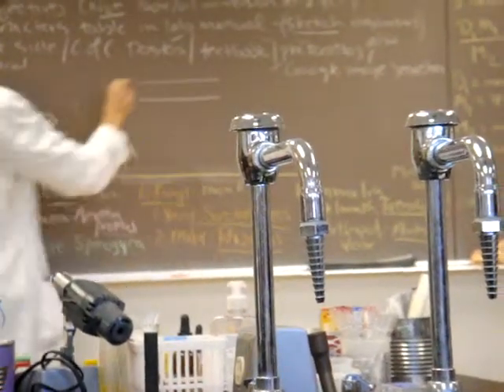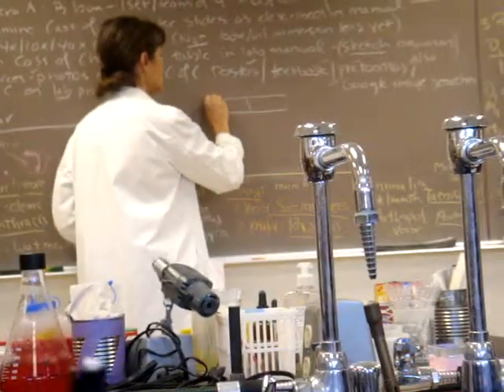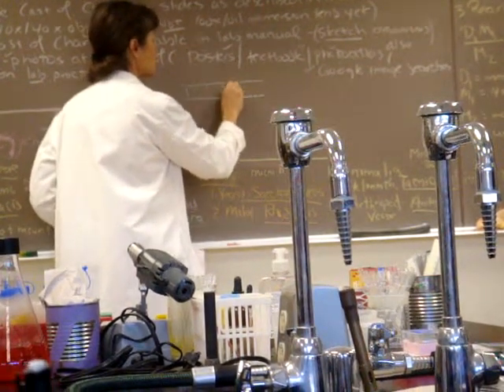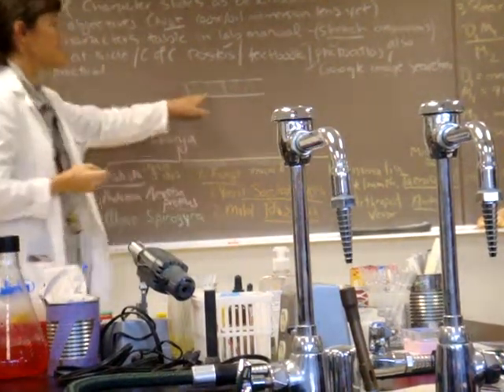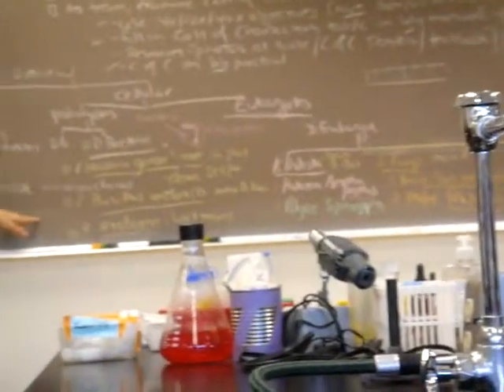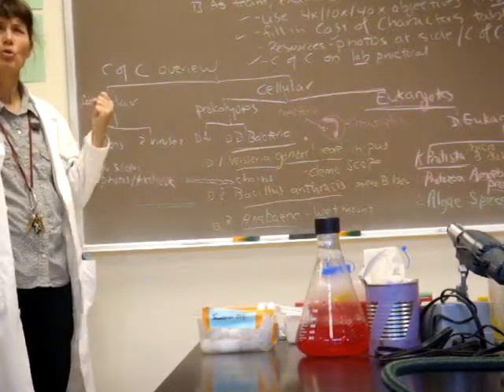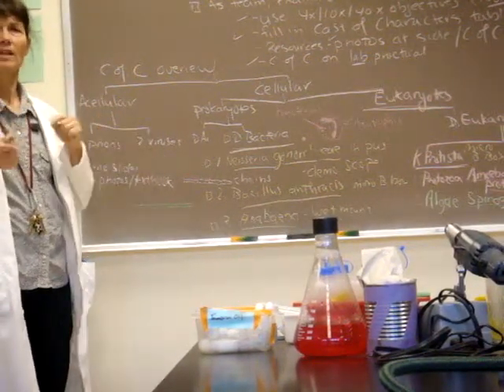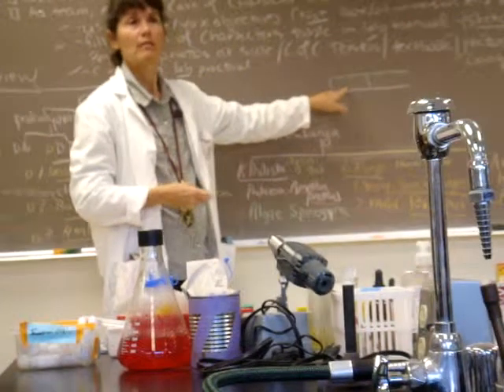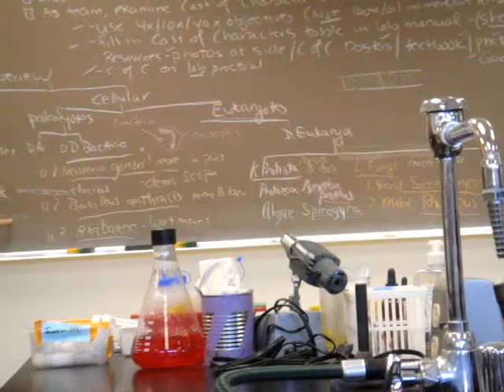They're much bigger than the cyanobacteria, and they're going to form chains. And what's beautiful is they have this spiral chloroplast. And what folks were noticing was the size of the spiral chloroplast. It was the same size as the Anabaena. And it was like, that is so cool because, remember, according to the endosymbiotic theory, where did those chloroplasts evolve from? Cyanobacteria. Yeah, they evolved from the cyanobacteria.